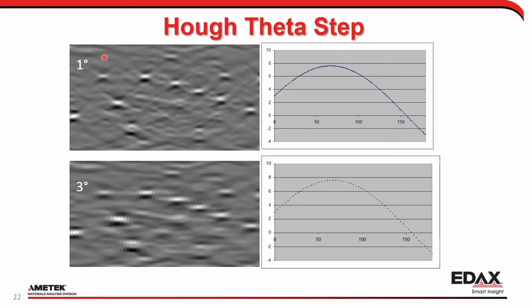Just getting a little bit ahead of myself here, but for the fastest speeds and velocity, the theta step has to be 2 degrees, because it's so computationally heavy to be doing this kind of accumulator array that the computational power just goes up very quickly. And because of that, we're actually ahead of computers. The computers for velocities are incredibly strong, and with that in mind, you have to actually do less work because it's even too much for top of the line computers.